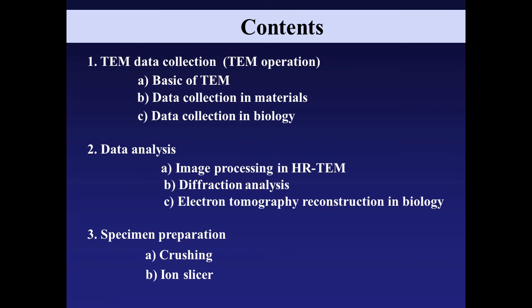But I already received many questions, about 37 questions, but time is limited. Now I'd like to just introduce the answer to one question. The question is, can you perform TEM under high pressure and low temperature? We are interested. What is the instrument limitation?